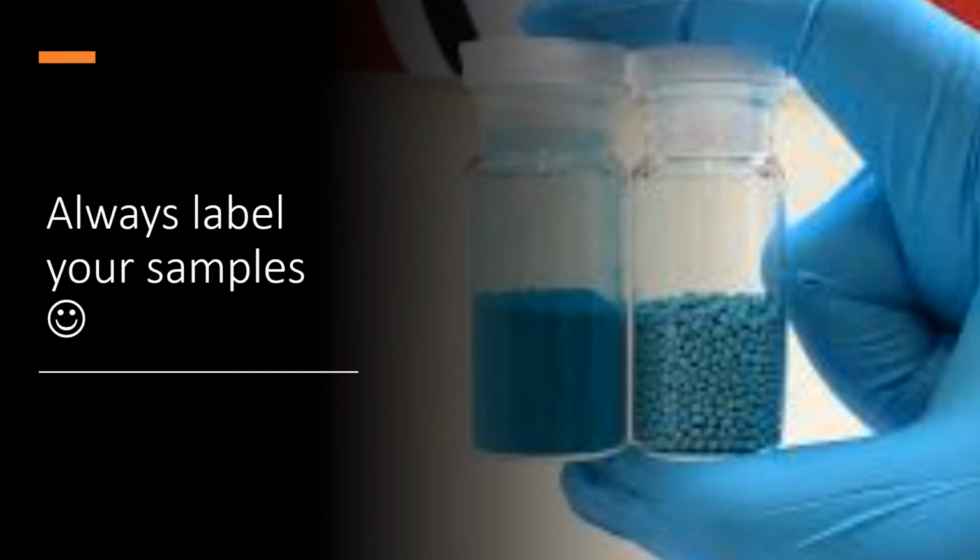Suppose you just got back to the lab after the pandemic-induced lockdown. You saw an unknown sample left unlabeled by your lab mate, and all you can see is that it is in powdered form and blue in color. You got curious about how it looked like on the nanoscale and wanted to use an SEM.